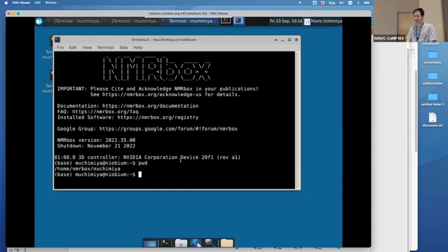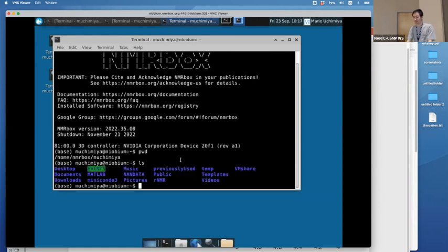Now he has to change folders, or directories. So he's first going to type ls. This is going to give him a list of everything that's in his folder. And the blue items are all folders, right? Yeah, and I guess the green indicates that it's a group folder or something.